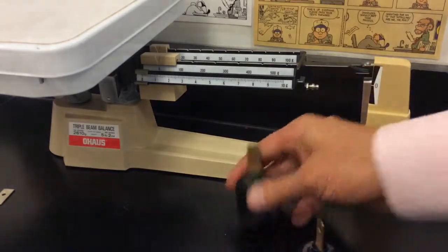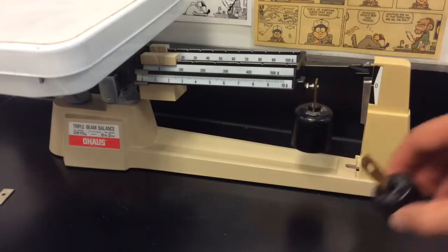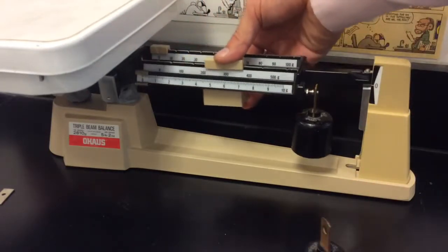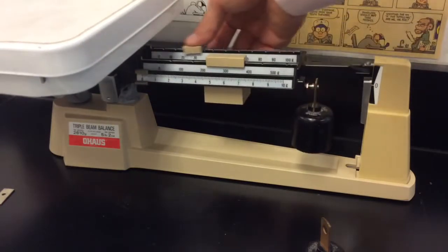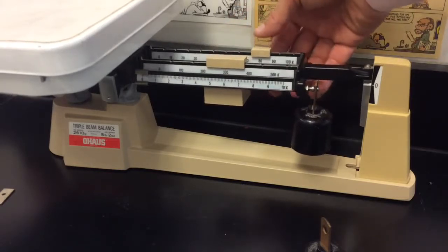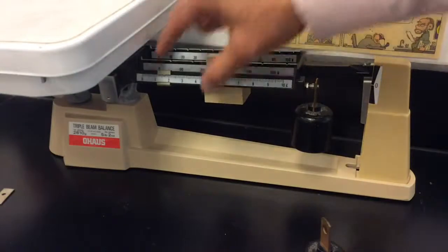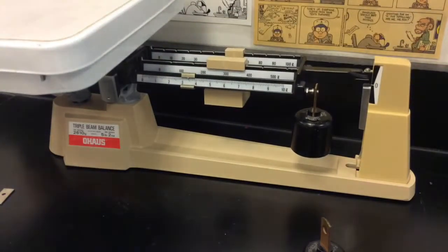At five hundred grams it's not enough; at a thousand it's more than enough; and at fifteen hundred it's too much. So you take the five hundred off and balance it out. Once balanced, the total is one thousand grams plus whatever is indicated on the balance. Note that those masses are not actually five hundred or one thousand grams — they count as five hundred or one thousand grams when placed in that position on this balance. The total capacity of this balance is about 2.6 kilograms.